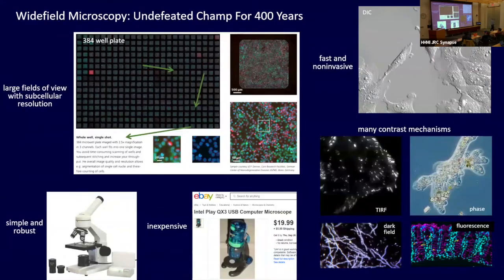It's been around for 400 years. That's what biologists use. Why? Large fields of view, simple and robust for a biologist. Even if they smash the damn objective into the slide, it's not a big deal. Inexpensive, lots of contrast mechanisms, fast and non-invasive. Undefeated champ for 400 years.